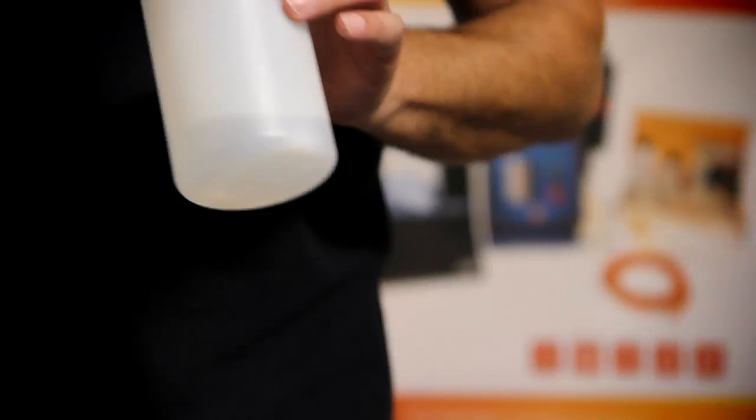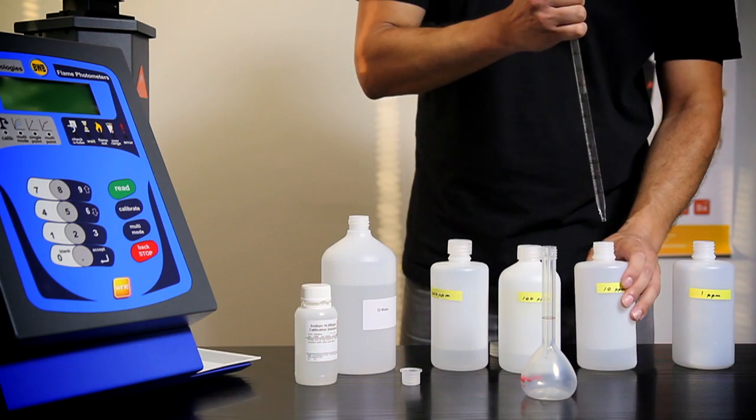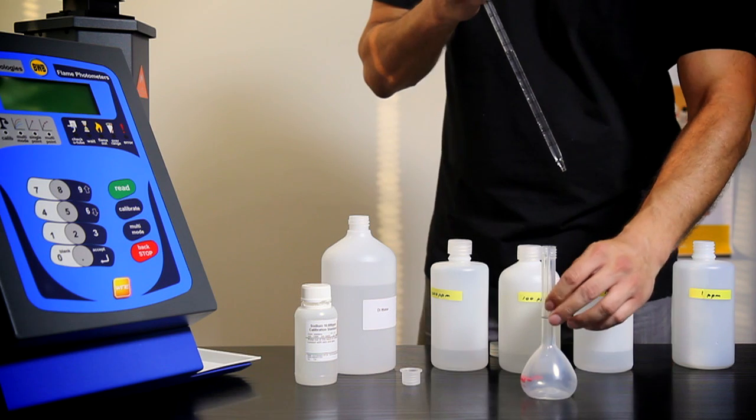Finally, repeat the whole process again using 10 ml of your 10 ppm standard. This will form your 1 ppm standard.